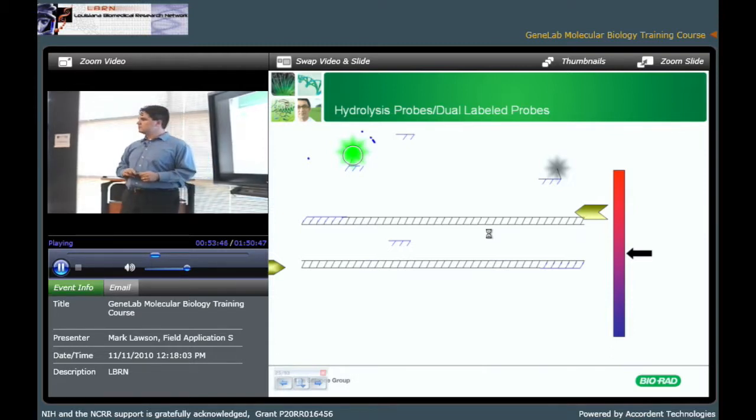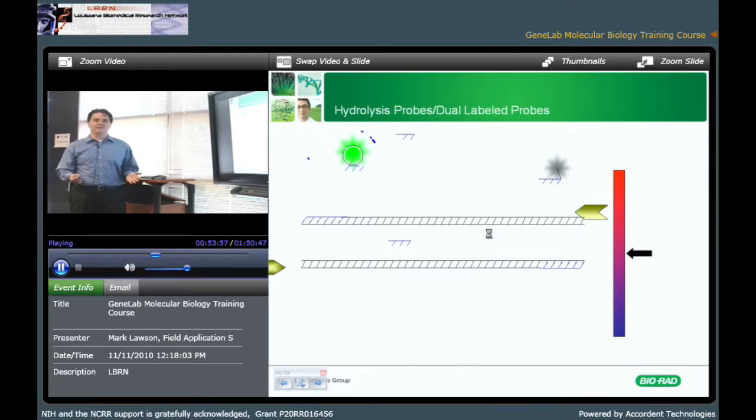That melting curve will give you some idea. It's easier than that. What if we ran the reaction at 68 degrees? I was thinking a gradient PCR. Well, you could do that too, yeah. You could run a gradient. You could just basically test the reactions.